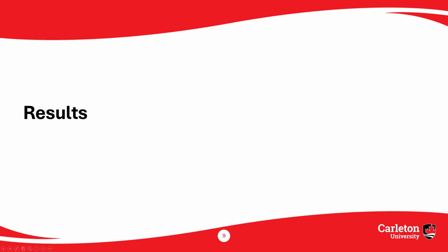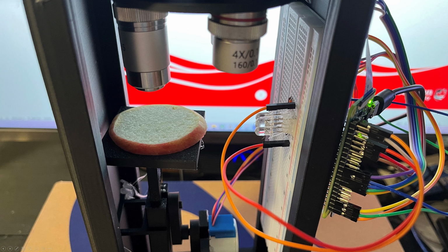And finally, the results part. Theoretically, I should have a thin sample, but I don't have specific instruments for that, so a slice of apple is taken instead. As you can see, pictures are taken under different magnification factors, and they are clear enough to see the details of the apple.